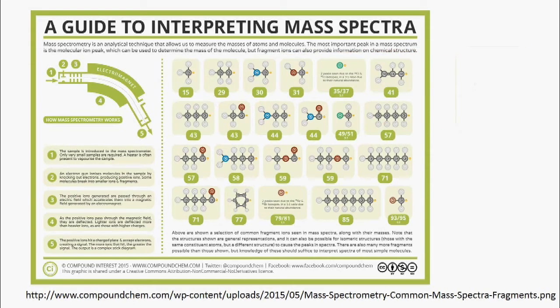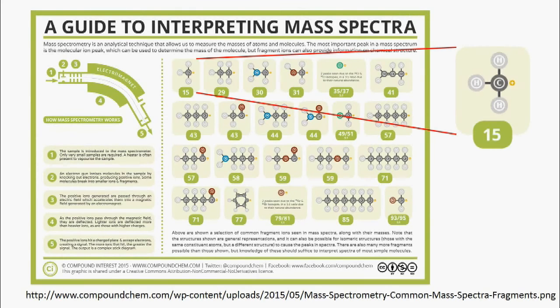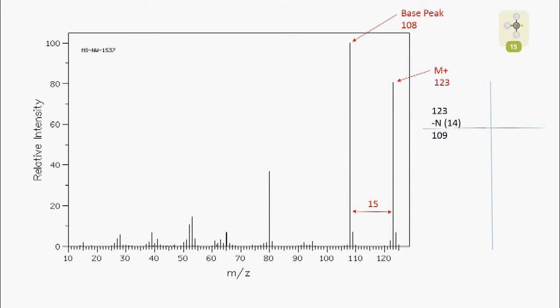Potentially, because as you see before you, there isn't any 28 on this cheat sheet, which means that 28 could be a very simple difference. It could be this 29 minus a hydrogen. It could be all sorts of things. The point is that we are not totally sure. So, any interpretations you make with this that aren't backed up by either your IR or other data, take with a grain of salt.